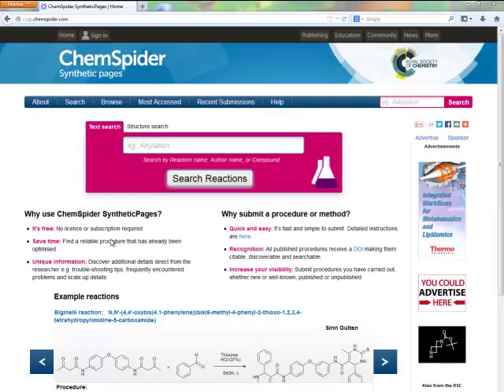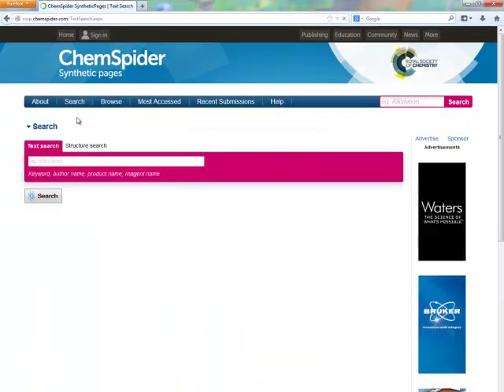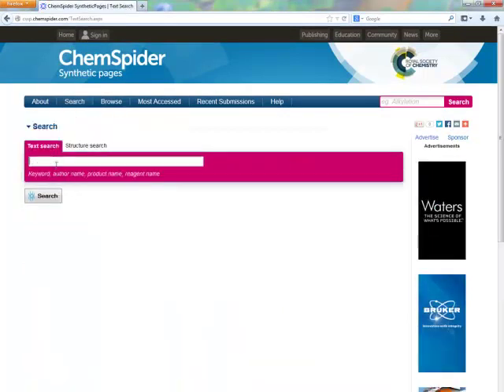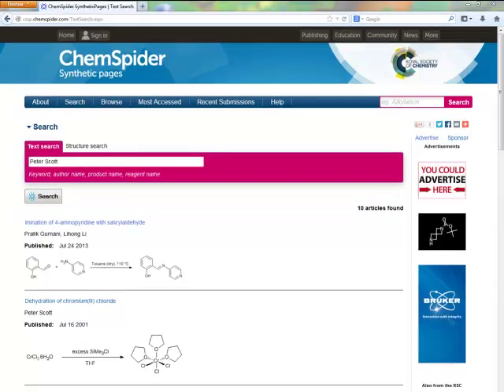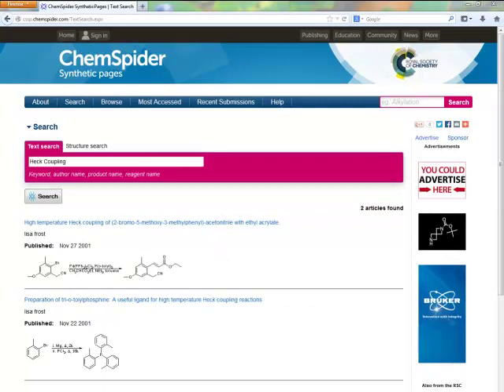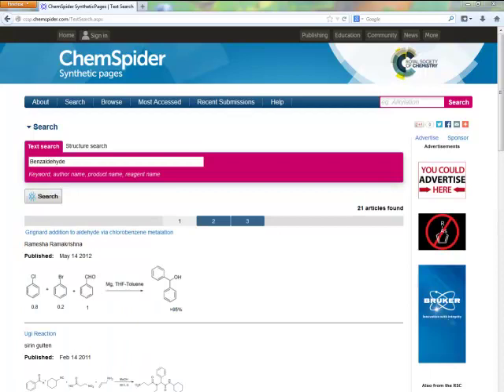You can perform a text search from the ChemSpider Synthetic Pages homepage, or by selecting text search from the search menu. Then input your search term into the box. You can search for author names like Peter Scott, reaction names like HEC coupling, keywords like alkynes, or you can look for a specific compound like benzaldehyde.